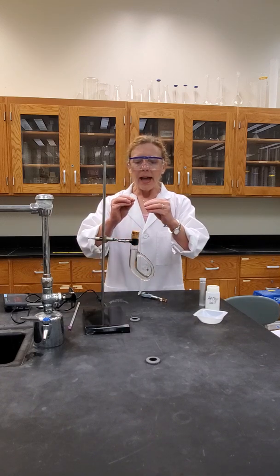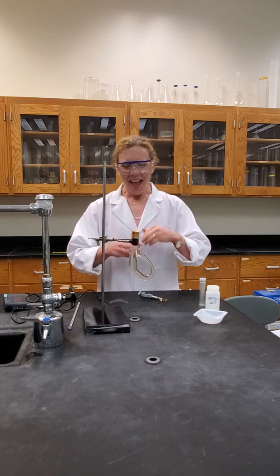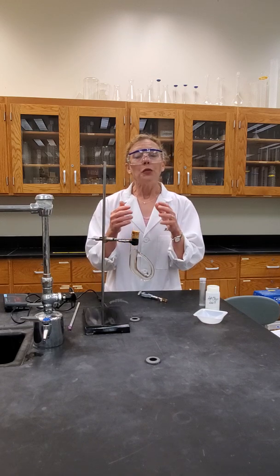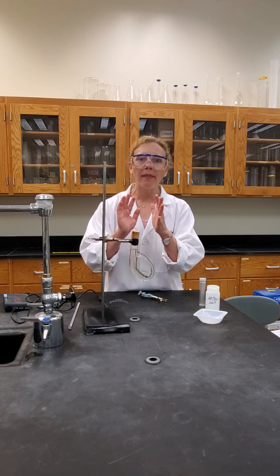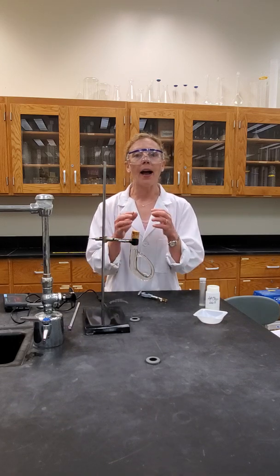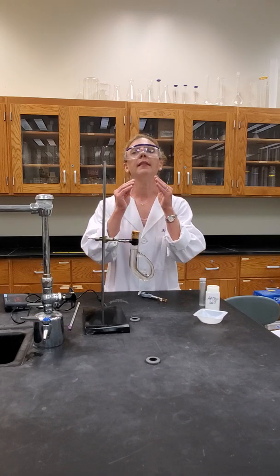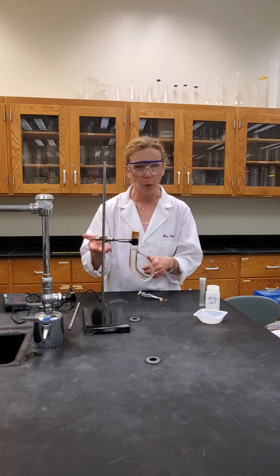All right. A Thiel tube, I know, looks odd, but it is specifically designed to contain mineral oil. And this shape allows for a nice equal distribution of an increase in temperature to your compound so that we can accurately and precisely measure when it liquefies.